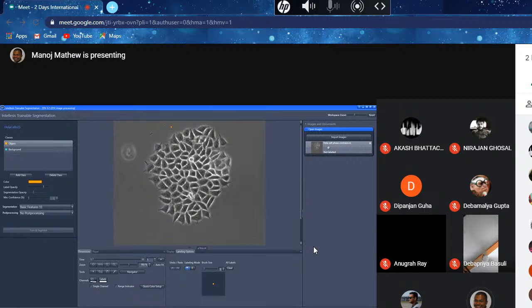All right. So one of the first things I have to do here is to decide how many features I want. As I was saying, in a traditional image segmentation, you are using one feature, you are using intensity, or variance, or something like that. But in machine learning, you can use multiple features, like our example with apples and oranges. When I look at an apple and orange, I'm not looking at just one parameter.